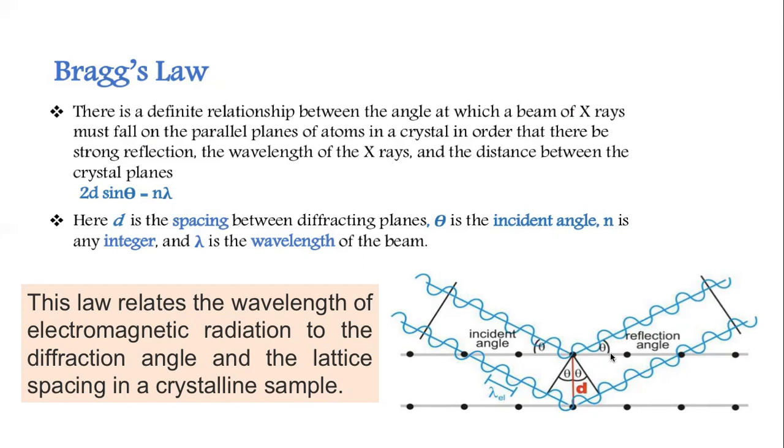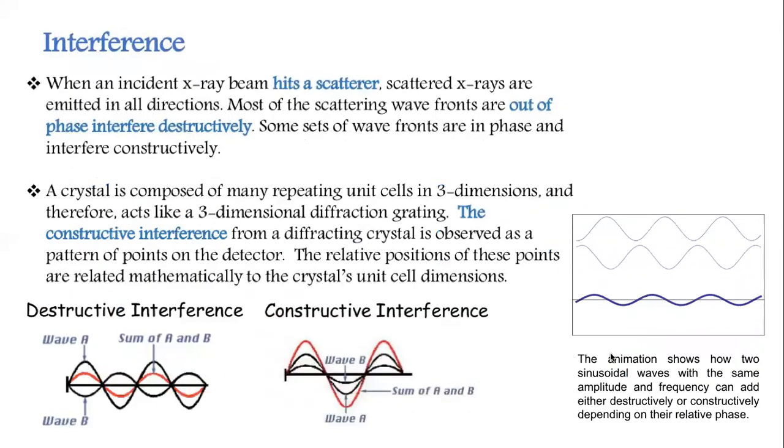So it gives us an idea of how an X-ray, when it hits a crystalline molecule, behaves, and what kind of pattern it will generate once the diffraction is taking place, or the interaction between the X-rays and the matter. This particularly happens like diffraction, and it is also the result of another kind of phenomenon known as scattering and interference.